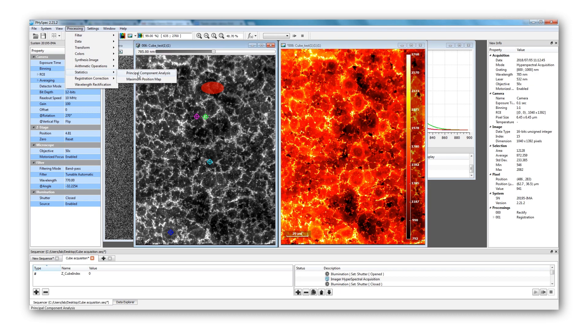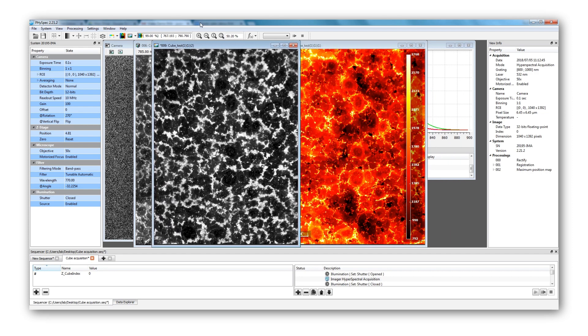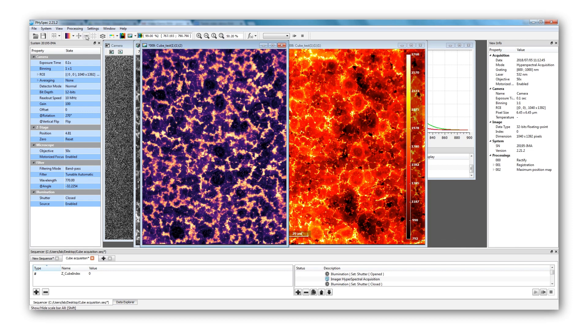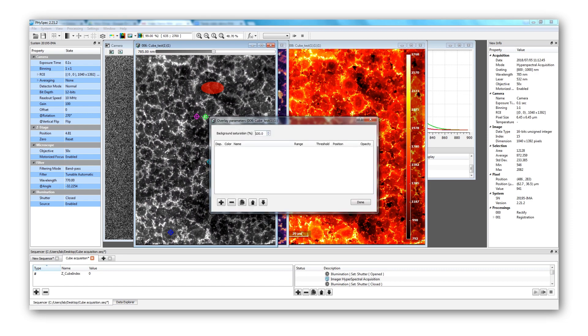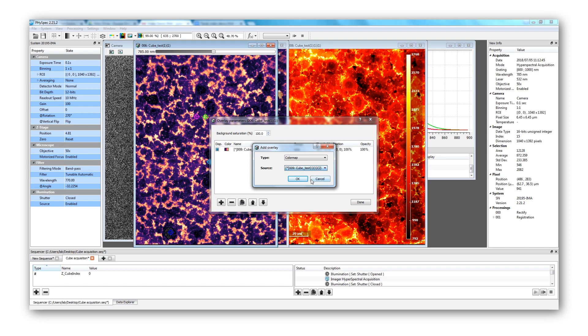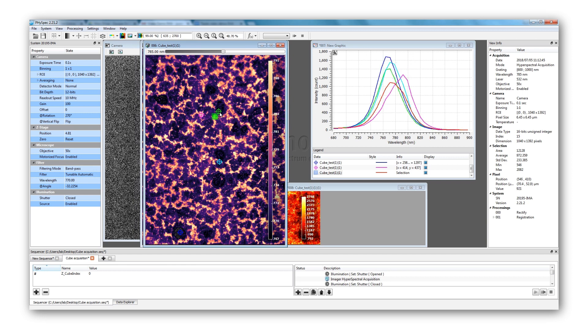Another interesting map is the map of the photoluminescence central wavelength, which gives the wavelength at which the maximum intensity, or spectrum peak, occurs in nanometers. This map allows you to clearly see the shift in wavelength. In this case, the lighter regions have a PL central wavelength around 800 nanometers and the darker regions around 760 nanometers. It is also possible to stack a false-colour map on top of the data and verify that the maxima found with the analysis correspond to what was acquired. Looking at the purple target, the bright regions exhibit a PL maximum intensity around 795 nanometers, while the green target is located in a darker region and presents a maximum of intensity around 765 nanometers.